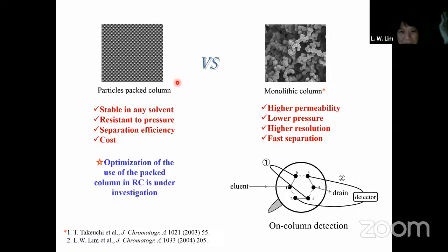But if your sample is too oily, can you dissolve it in some organic solvent like methanol? You can, if your eluent is like 70% acetonitrile or whatever, then you can use it. But usually when it's too oily, you have to use a good solvent so that it will be totally dissolved in your solvent.